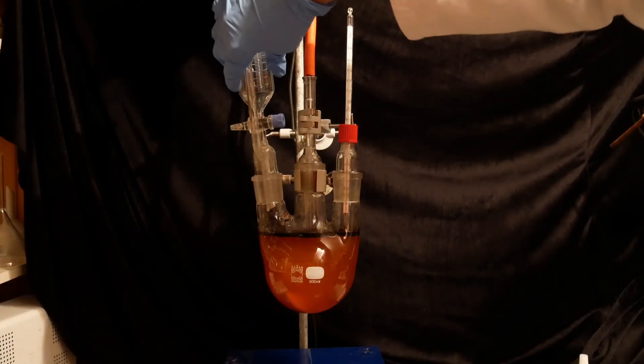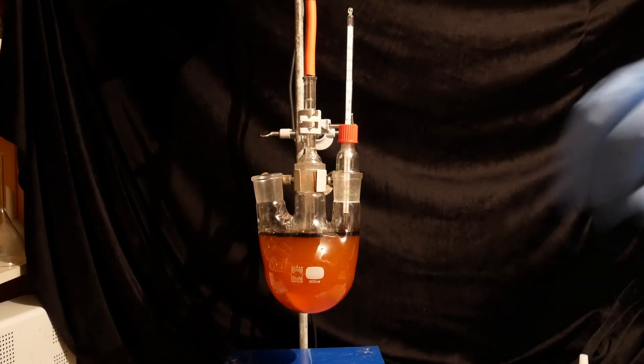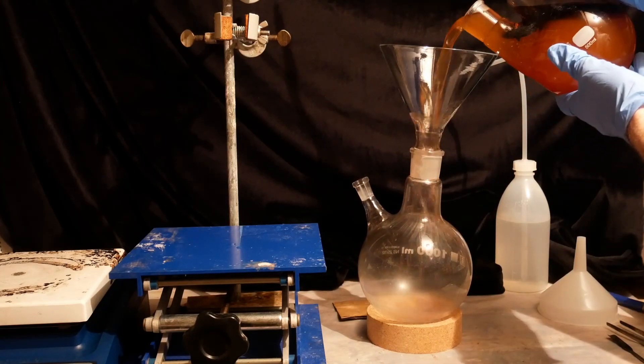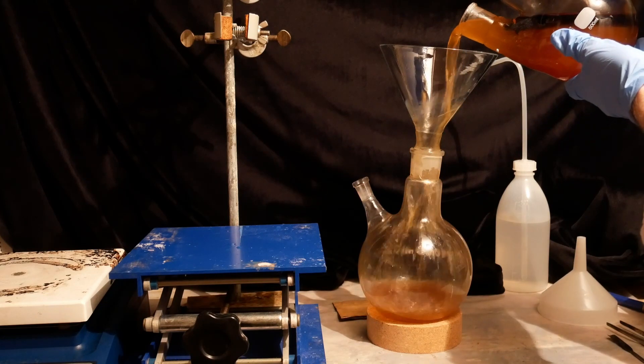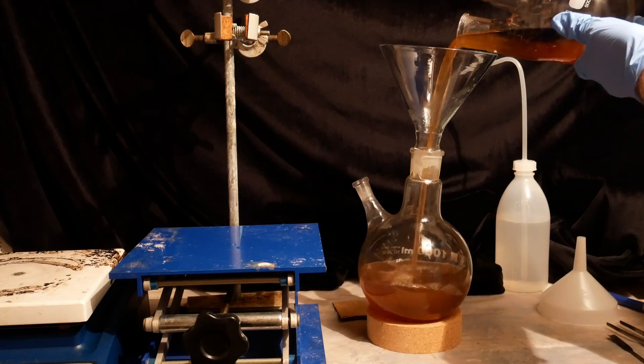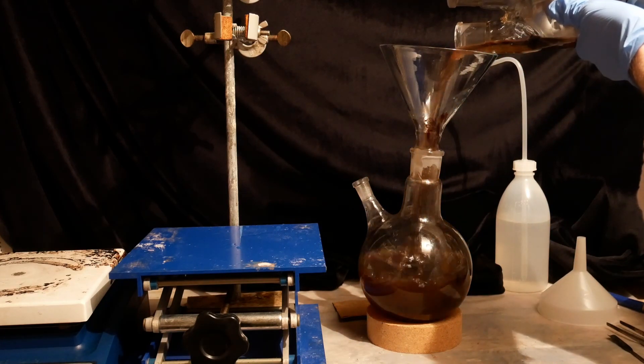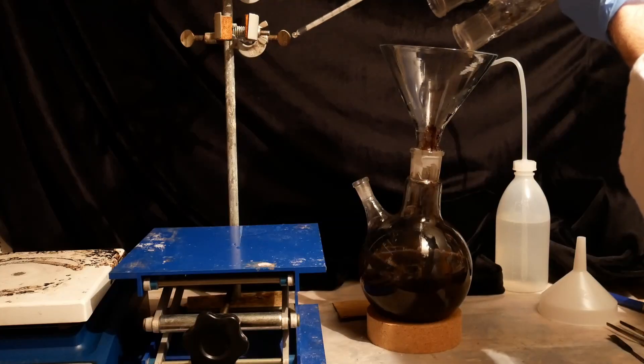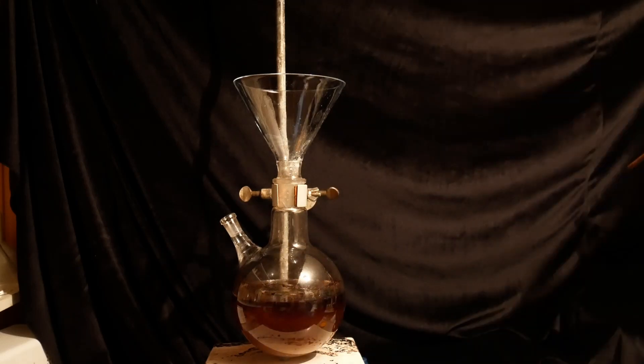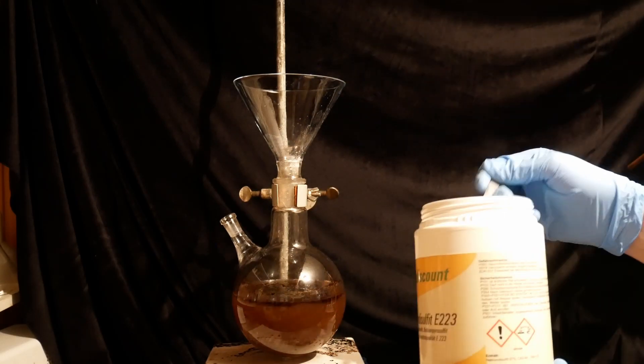The setup is now disassembled and the raw reaction mix is transferred to a bigger flask for the next step. To fully decompose the intermediate carbamate salt, the mixture has to be acidified to a pH of about 2.